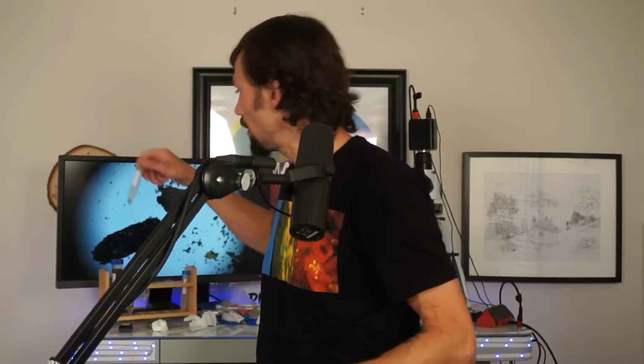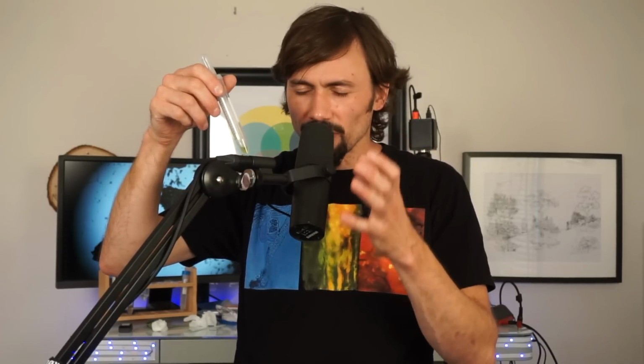I just take 1 ml out of that, put it into a separate tube. And as you can see, I like working in small amounts. It's because of my DNA testing experience. I'm very used to tiny amounts being sufficient. So you do fractions of a drop, fractions and fractions and fractions of a drop with micro pipettes. So it's amazing. So 1 ml of the 1 to 100 from the other tube, that's compost or soil to water, distilled water. And then I add 2 drops of Acridine Orange that's been diluted twice, right?